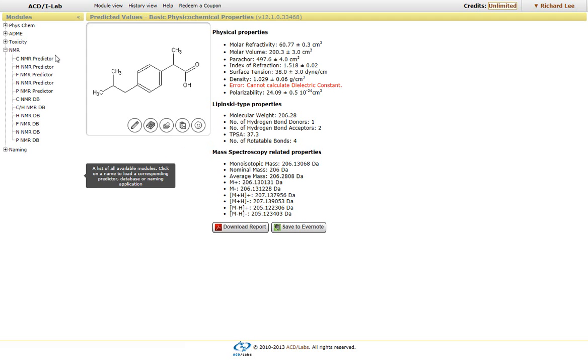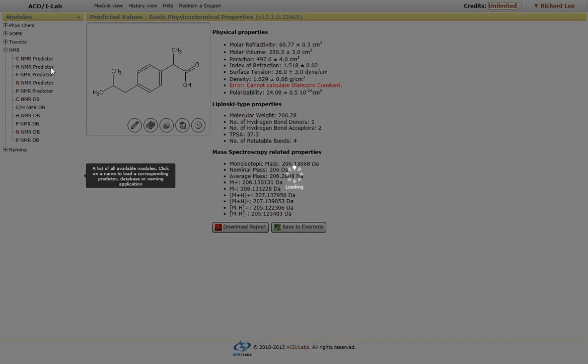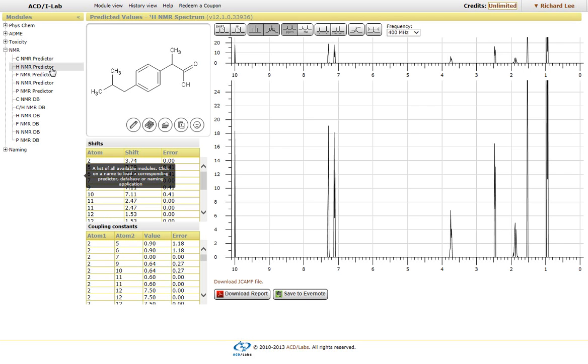By clicking on the predictor, our NMR predictor algorithms will generate a simulated NMR spectrum. Now our NMR prediction algorithms are the gold standard within the industry.